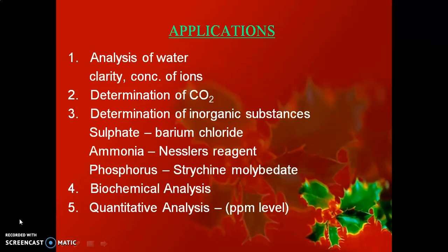Then applications. It is used for analysis of water to determine clarity or concentration of ions. For determination of carbon dioxide, we can use this technique. Determination of inorganic substances such as sulfate, ammonia, and phosphorus is also possible by this technique.